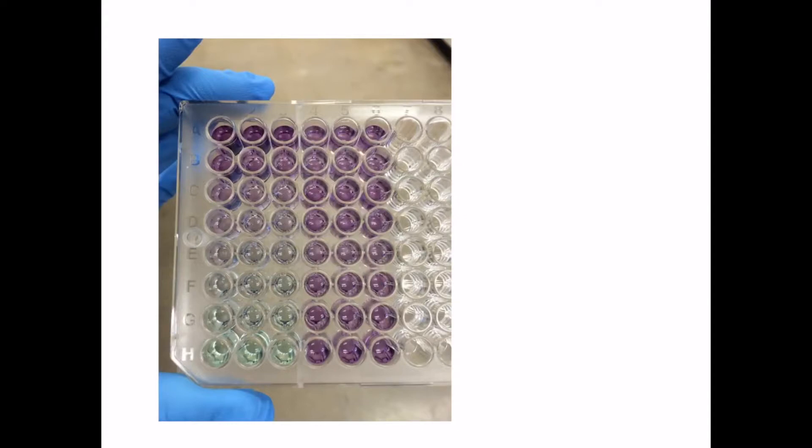So the way that this works is that on one side of this, there has been a standard curve pipetted, so this is a protein of known concentration on this side, and these are each different dilutions of that known protein, while on the other side is our unknown sample that we want to know the concentration of the protein.